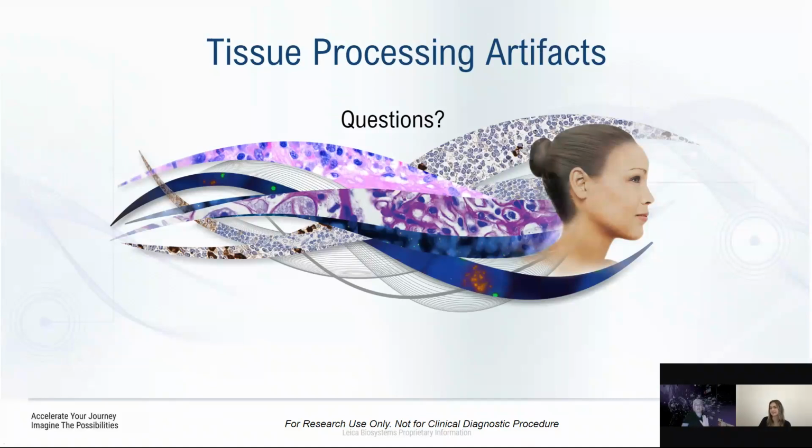Now, is it good to store the paraffin samples uncut in the fridge for more than 6 months? No. I'm trying to think of all the possibilities. The only special stain I can think about is amyloid. You probably want to coat the surface with paraffin. But when it comes to IHC, there are markers that are sensitive. It's not so much the temperature, but they are sensitive to the humidity in the refrigerator.